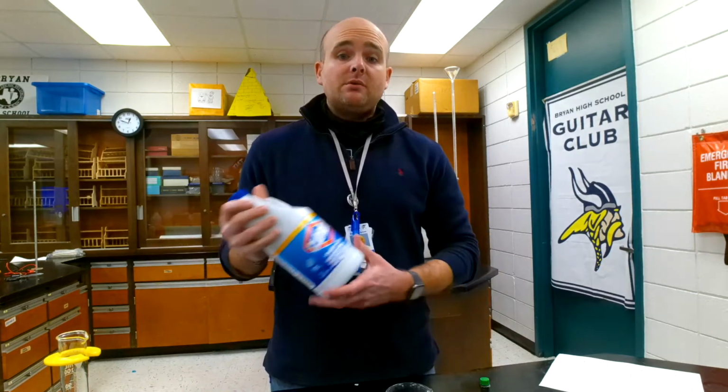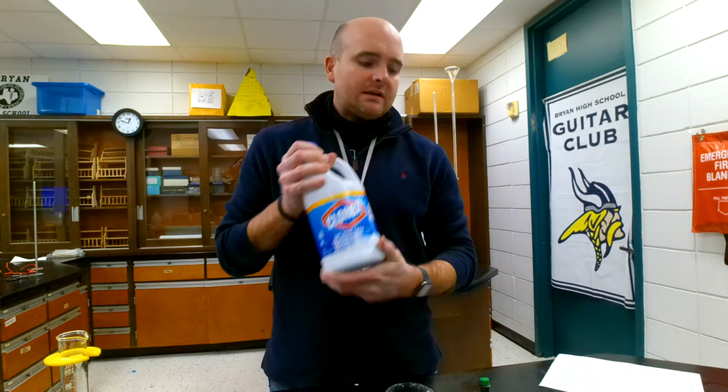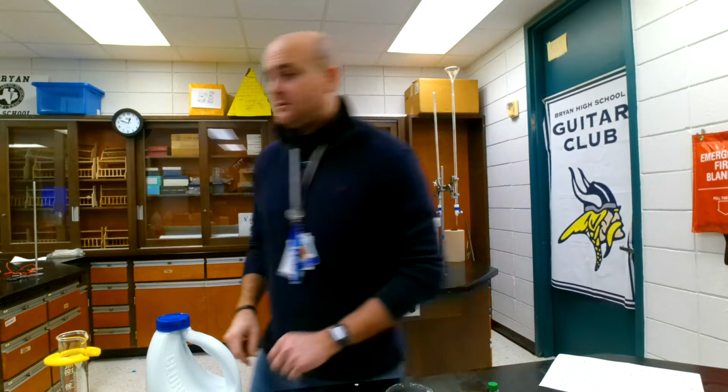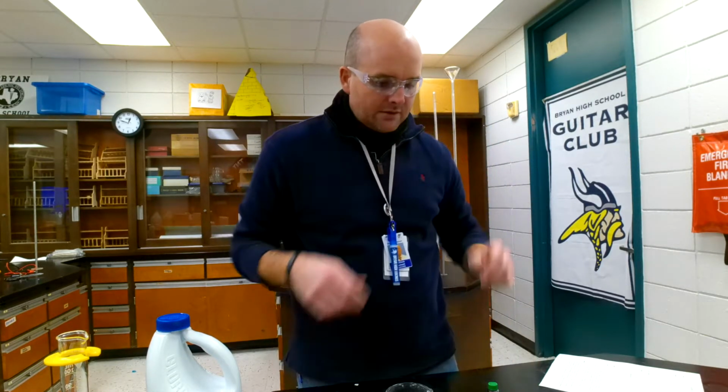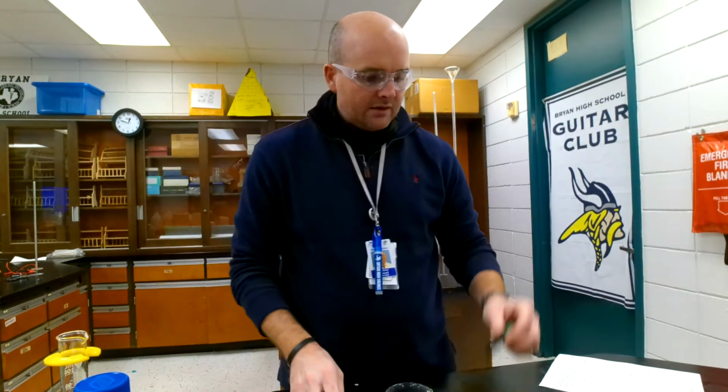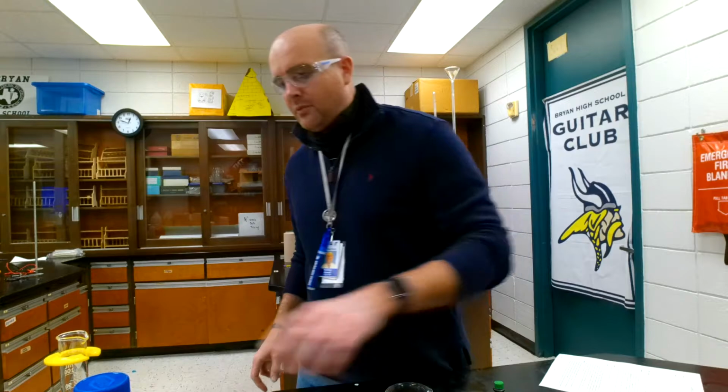Howdy. Today we're going to do an experiment with a little bit of Clorox and a little bit of green food color. Let me first get my safety goggles. Here we go.